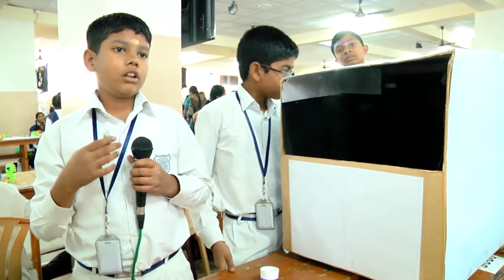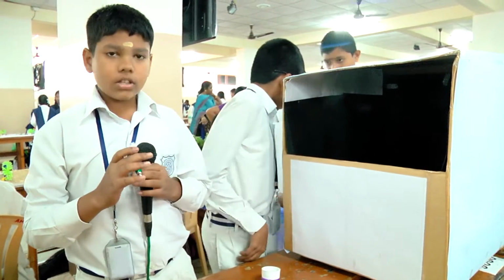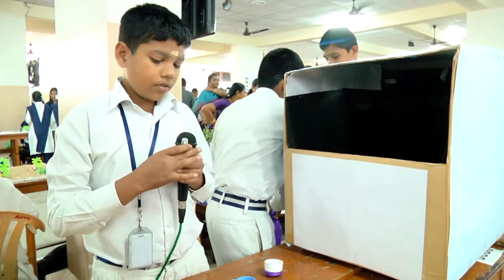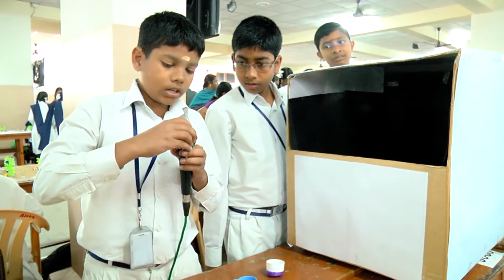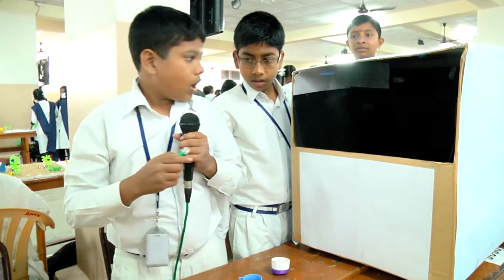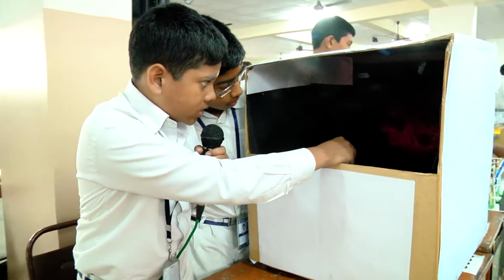If we want to do it at low cost, we can do it with the laser light. By using the laser light, we take a drop of the water and keep it at the tip of the laser light, and we press the button. We can see the microorganism on the screen.